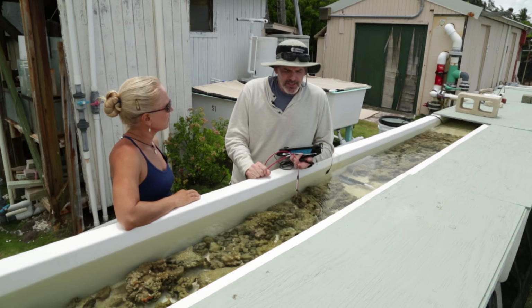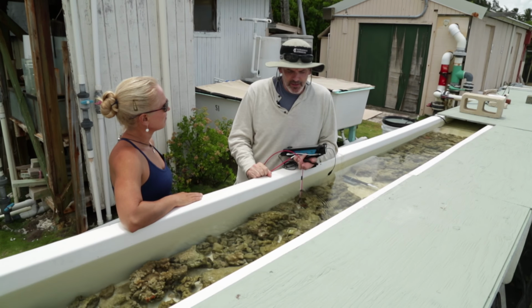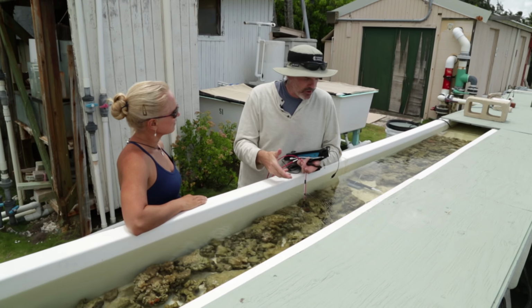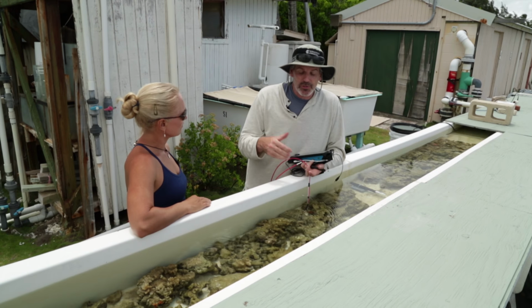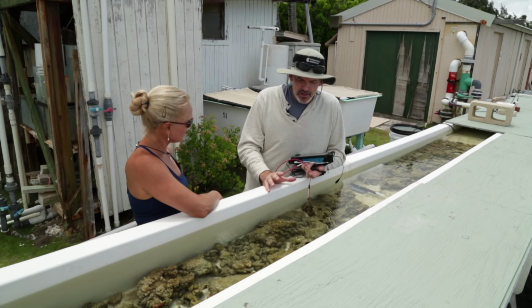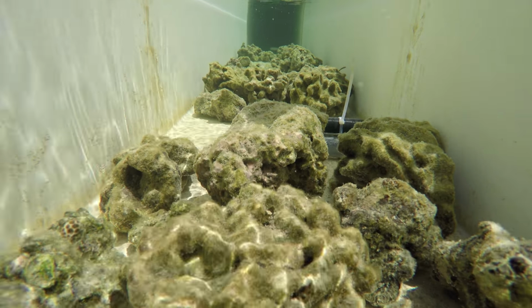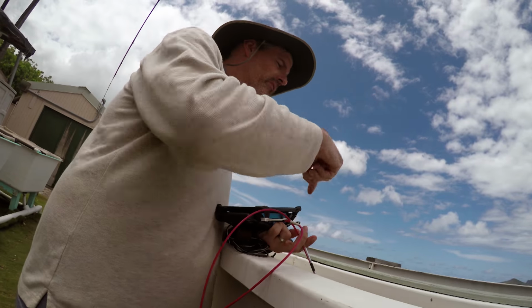A flume is a device that is using water that's drawn in from out in Kaneohe Bay, and it has a motor, and it's just recirculating water at a set speed. I have this water moving between 12 and 15 centimeters a second, and I'm able to completely shut it off. So if I had coral in here, I can measure the coral's respiration, what oxygen it's using, what CO2 it's putting out, and I can also measure its growth, its calcification, because it's a closed off system.